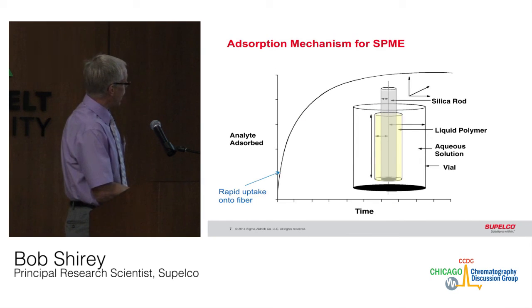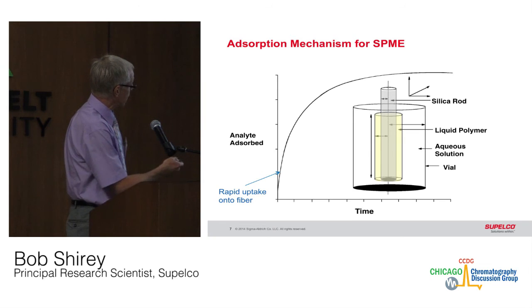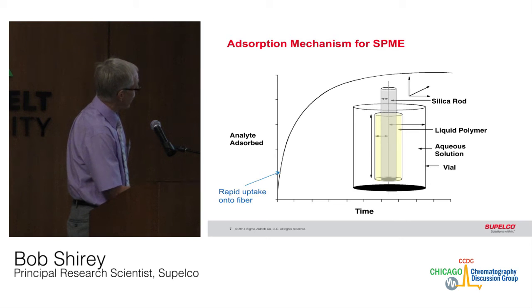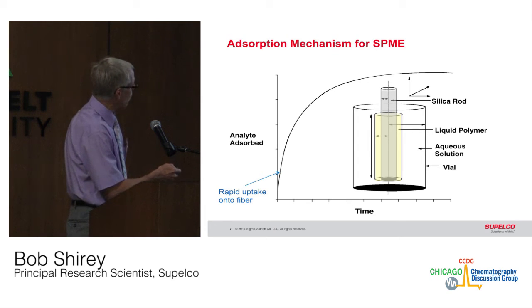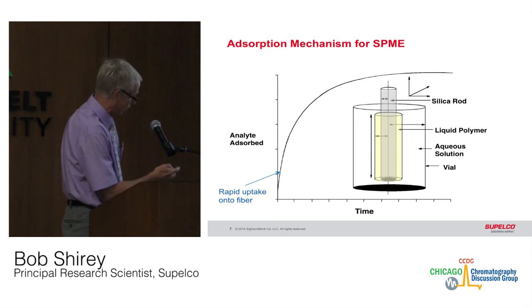If you look at the extraction time profile versus analyte response, you generally get this type of curve where you have a rapid uptake and eventually it begins to level off. At that point, you're at equilibrium, where the amount of analyte going into the fiber equals the amount of analyte going out of the fiber. This curve can vary. This would be more typical for a volatile compound. A large semi-volatile compound may have a much flatter, slower curve.